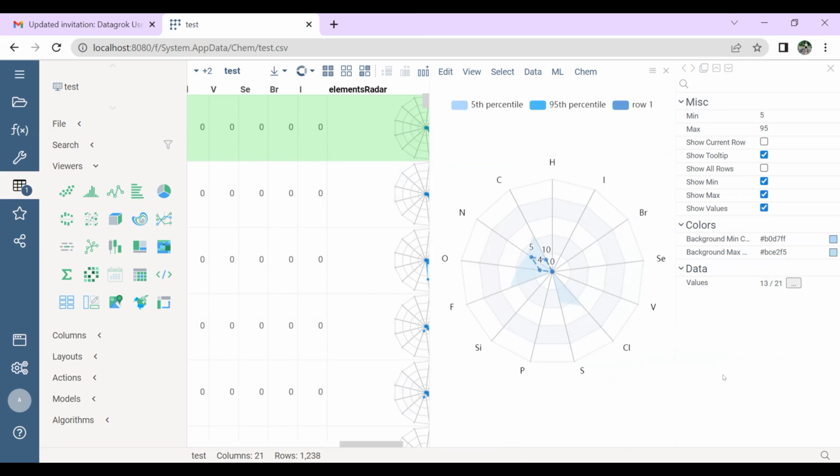So, for example, you can set the min and max percentiles here. There are options for min and max percentiles. Even a description is provided for those who see this for the first time. The minimal value here is rather small, that's why it is near 0. I will propose you to change it to 25, and to play with colors in order to see this minimal value better. For instance, let's do like that. Right now you can see the area for the minimum percentile. Also, you can play with the max percentile and switch like that.